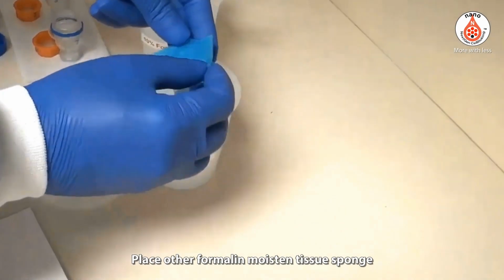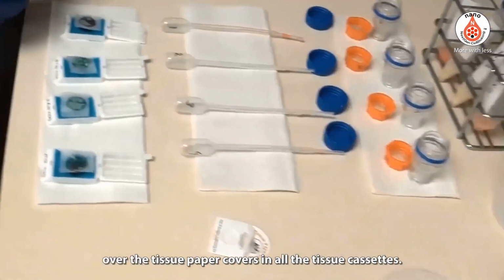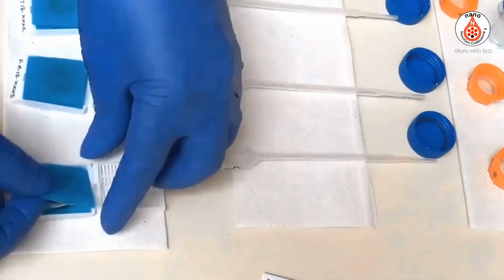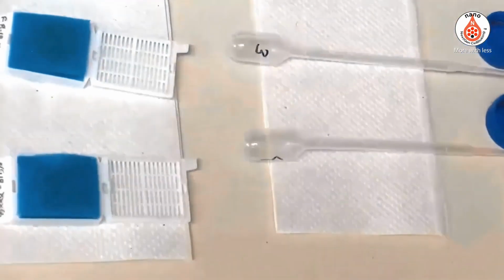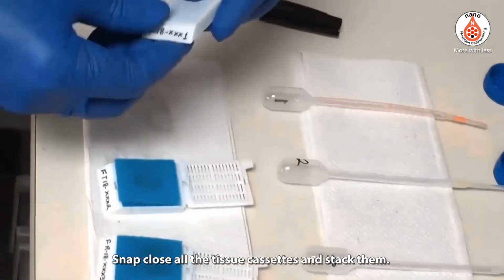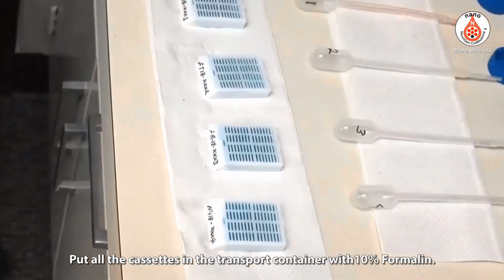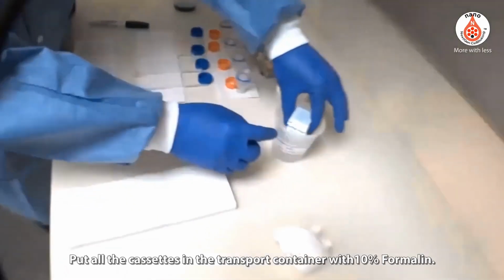Place another formalin-moistened tissue sponge over the tissue paper covers in all the tissue cassettes. Snap close all the tissue cassettes and stack them. Put all the cassettes in the transport container, with 10% formalin.